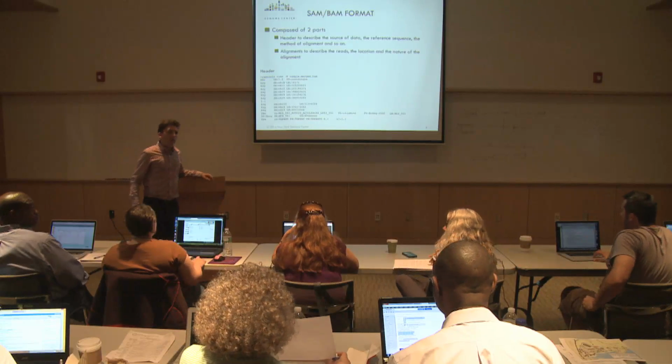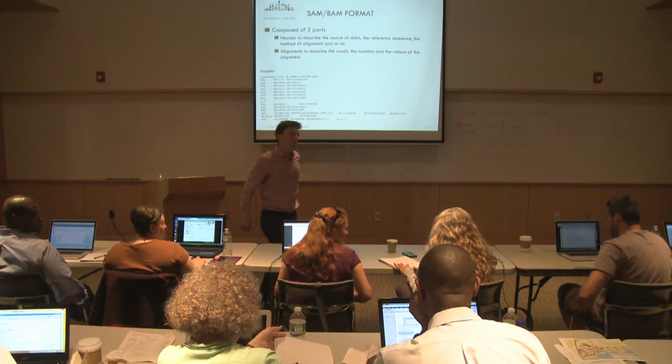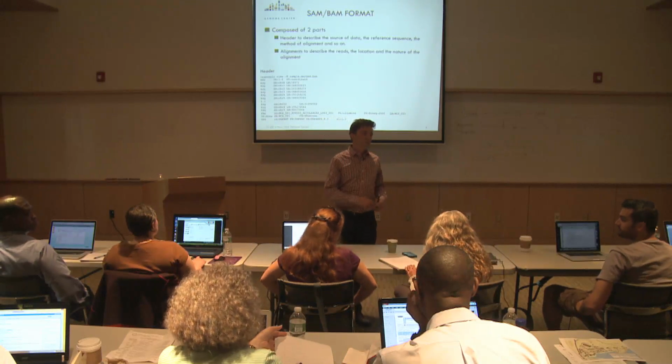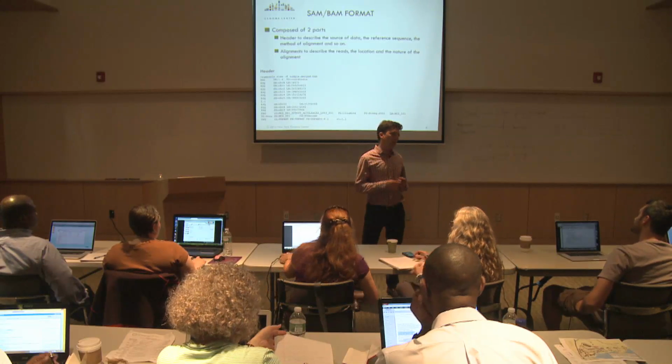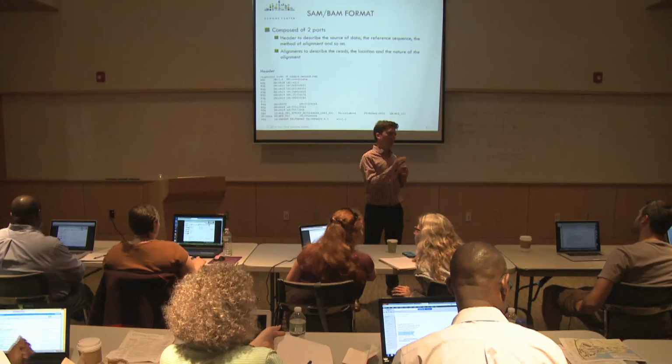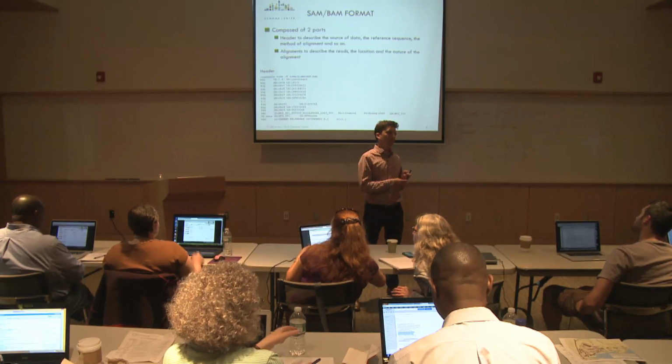This sounds a little like deduplication. Sorry? It sounds a little akin to the deduplication issue where you start ignoring these multiple reads. Yeah. This is not multiple reads. This is one read going to like 5 different places. Imagine a transposable element.